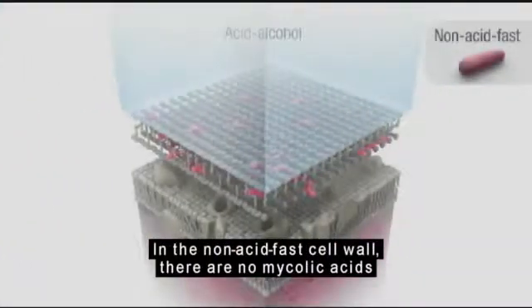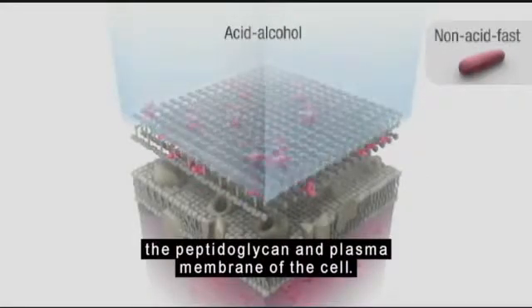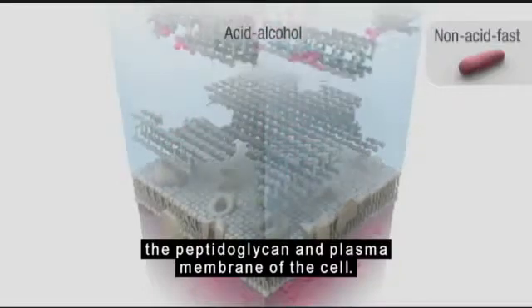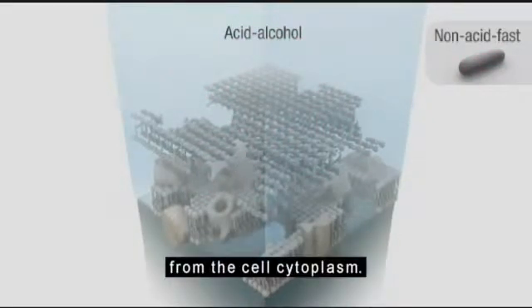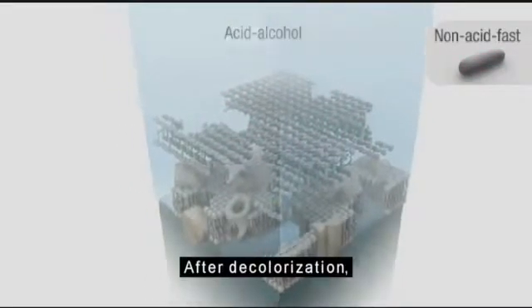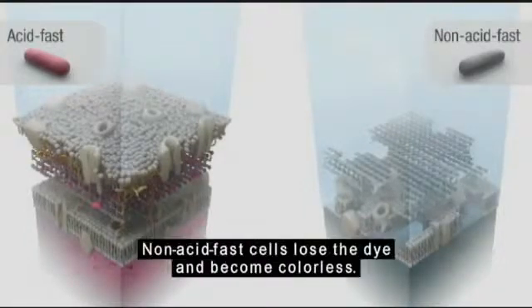In the non-acid-fast cell wall, there are no mycolic acids to impede the acid alcohol from penetrating the peptidoglycan and plasma membrane of the cell. Acid alcohol is able to wash out the carbolfuchsin primary stain from the cell cytoplasm. After decolorization, acid-fast cells retain the carbolfuchsin and remain red. Non-acid-fast cells lose the dye and become colorless.